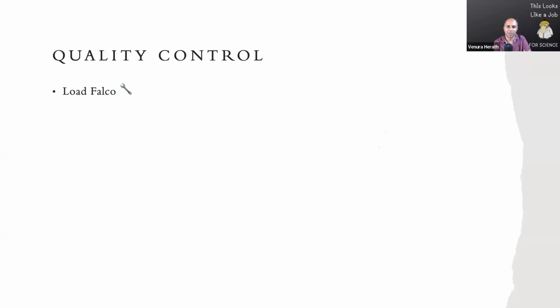And if you remember, last time we used the tool called Falco. Falco is like a more attractive wrapper based on FastQC, because FastQC is the most widely used sequence quality QC tool in the world, and it's developed by the Babraham Institute. But there are some wrappers built on FastQC in order to give a nicer appearance to the FastQC output.